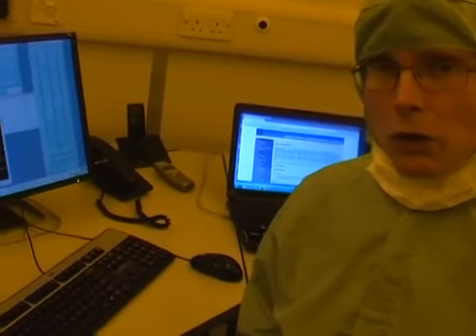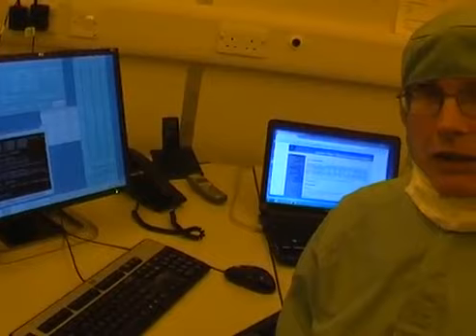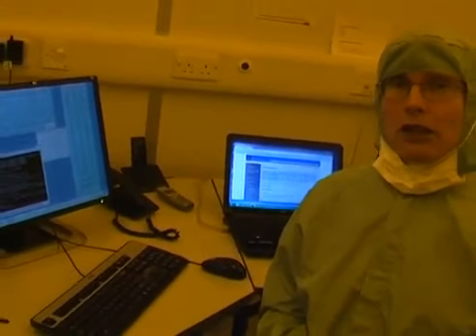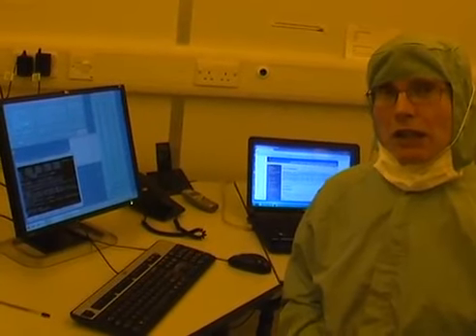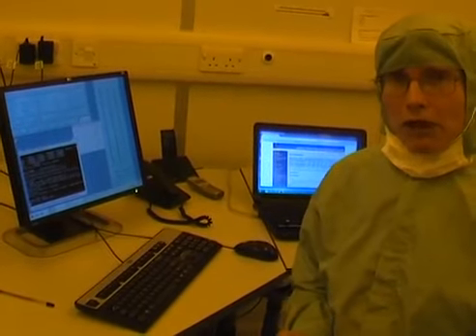You should make sure that your sample box is clean, both front and back, before you start writing on it, so when it's submitted, it's nice and clean. Otherwise, confusion can easily happen. If there's previous numbers written on the back of the sample or on the front of the sample, it becomes very hard for the operator.